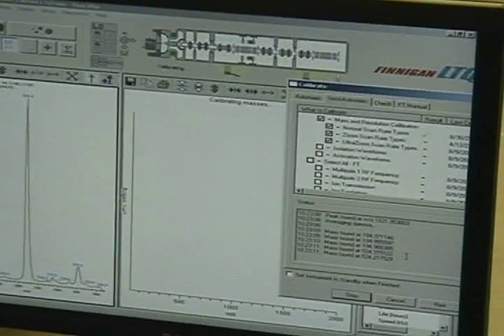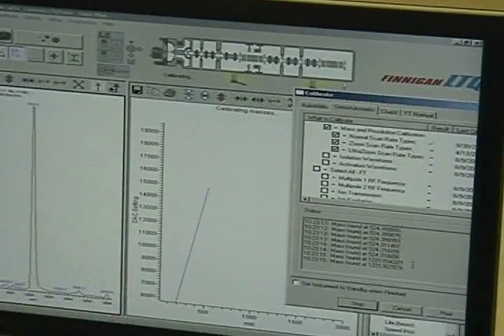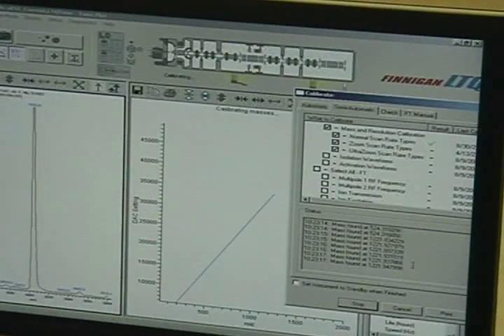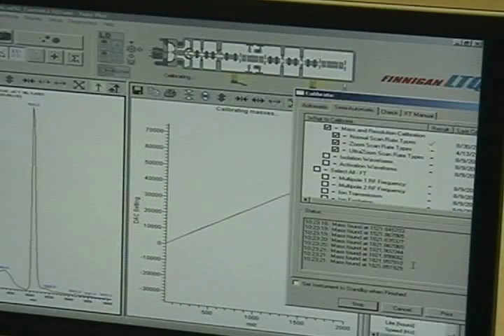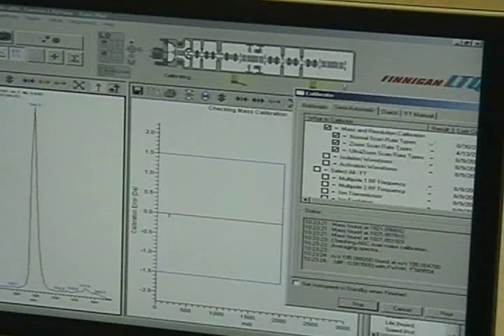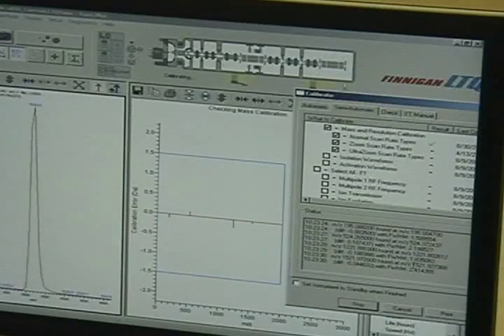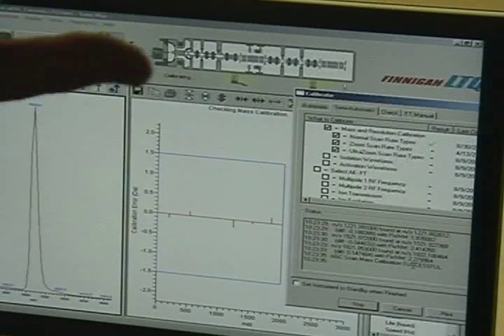The dipolar was resolution, the quadrupolar was mass. Because if we kick the ions out without the right dipolar voltage, we end up with weird peak widths. They kind of scatter and do some weird stuff. The quadrupolar is which voltage brings it up to the proper frequency at the right time.